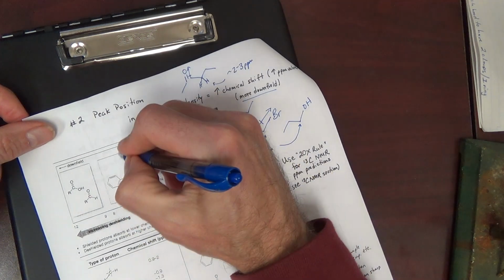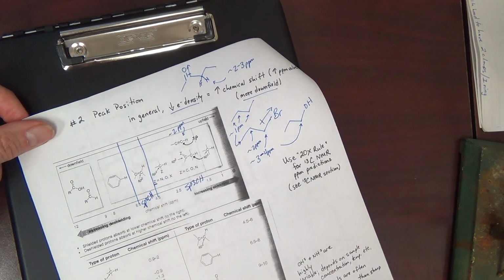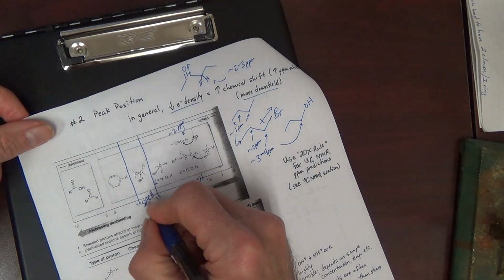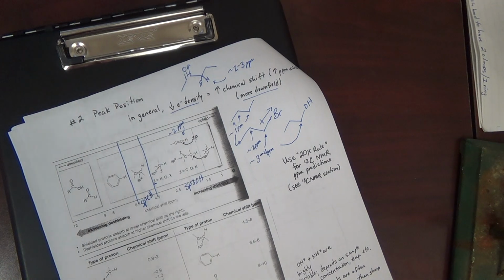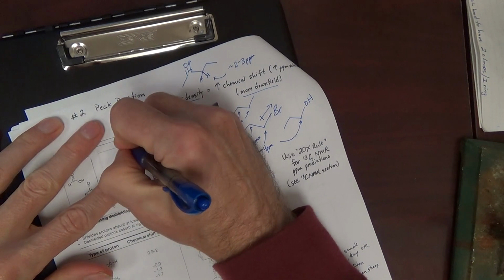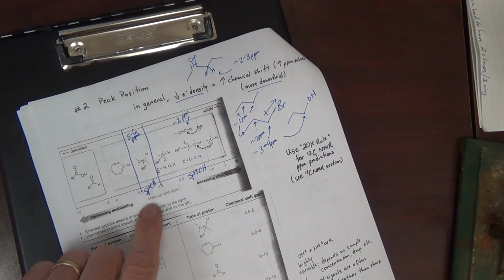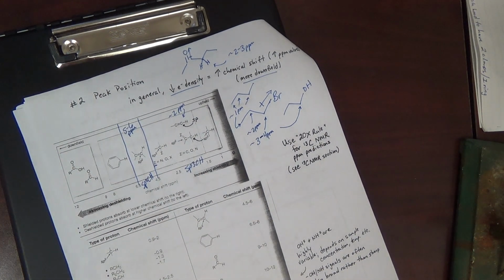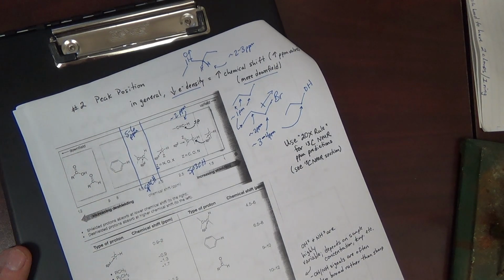The next region is the sp2 CH. This would be your alkene hydrogens or vinyl hydrogens, H's that are on alkene carbons. They occur at about 5 to 6 ppm. That's what you're going to hear from me. Now this table says 4.5 to 6.5. That's fine too. That's your alkene.